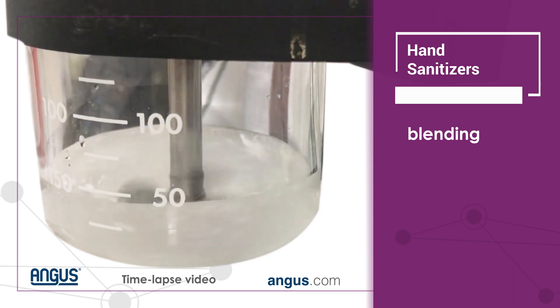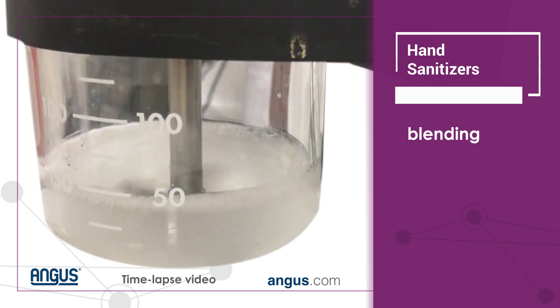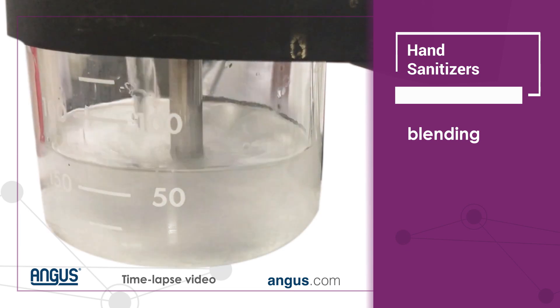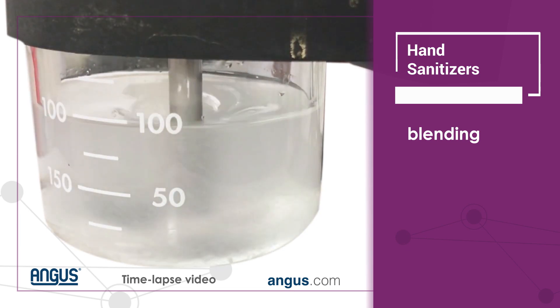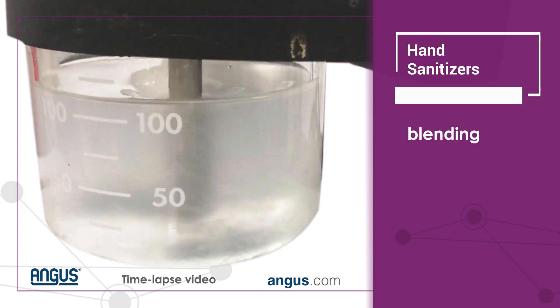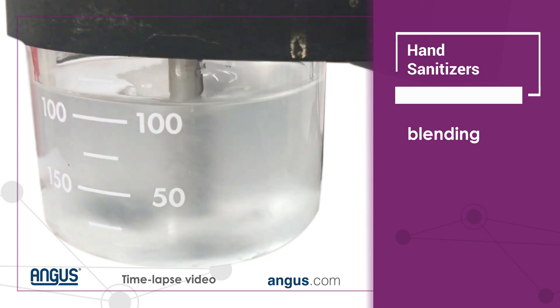Once we determine that the carbomer has been fully mixed in, we can move on to the next phase, which is adding the alcohol to the batch. In this case, the batch was very small, so the mixing blade was then adjusted to allow for better mixing.